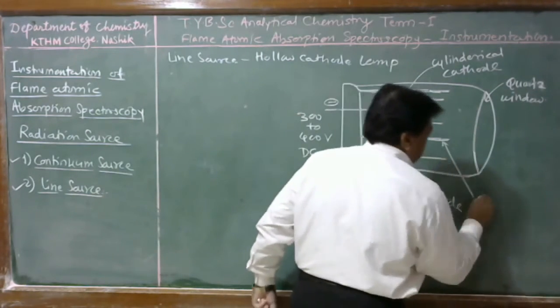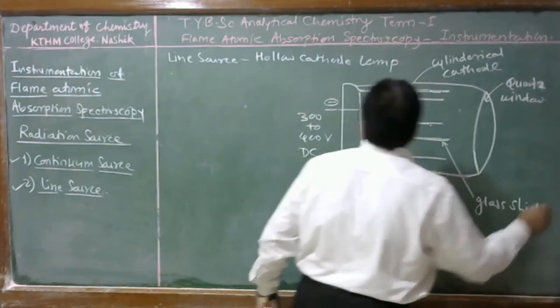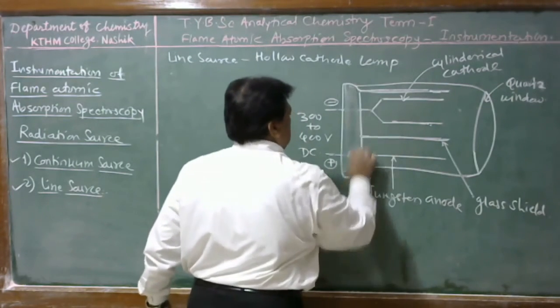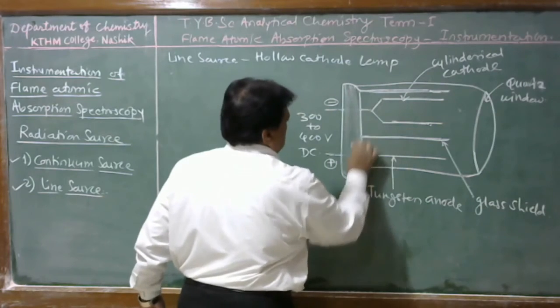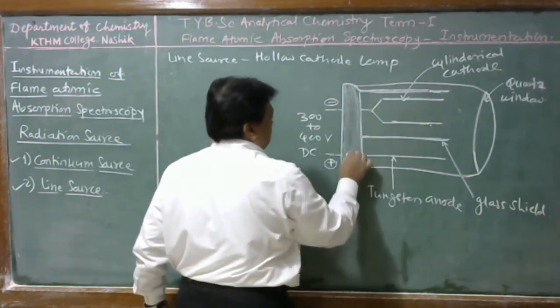This is a glass shield, and these are sealed in a material which is electrically resistant.